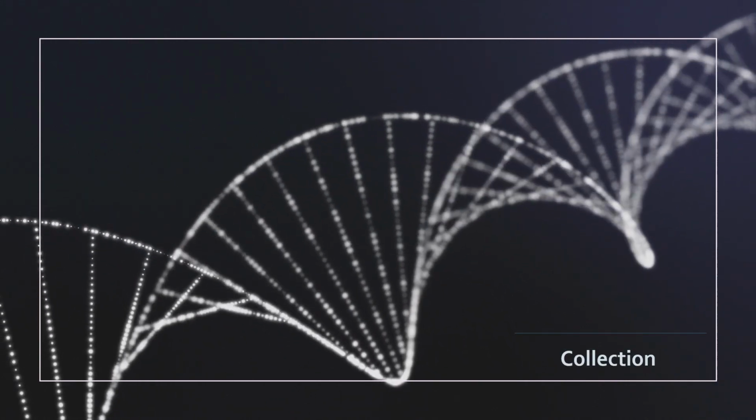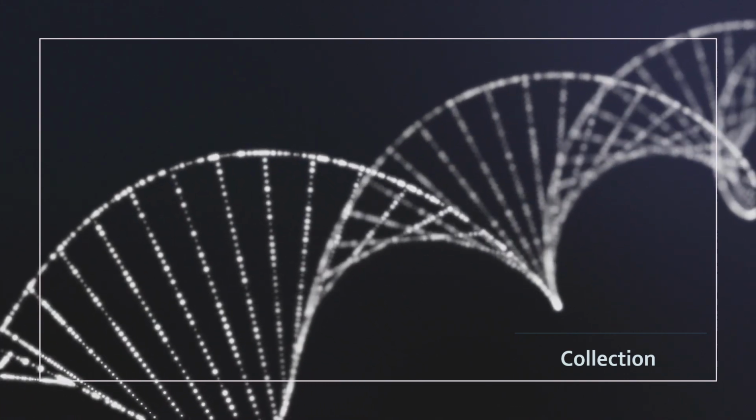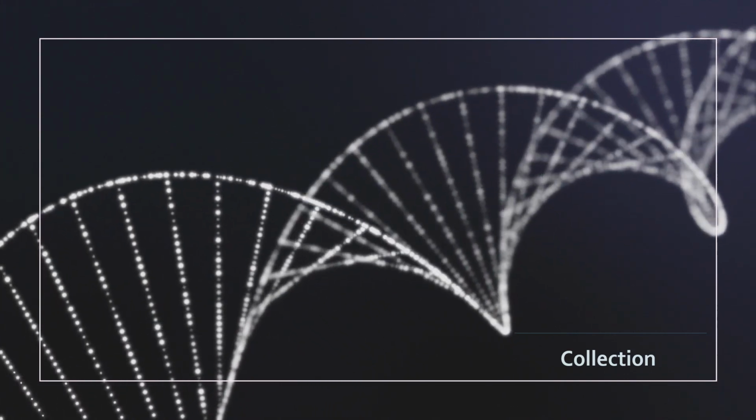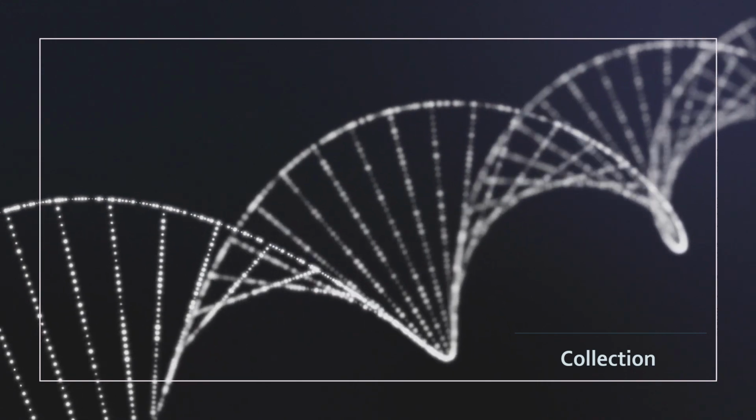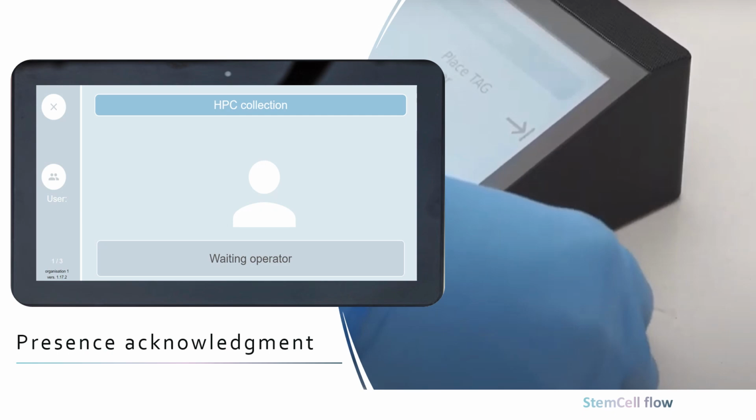The HPC collection site. The collection site can be in-house or external. Any product described in the European code lists can be configured. A device integrated in the SCWeb portal will be present by every single blood collection bed. This device will configure checklists based on the activity carried out.